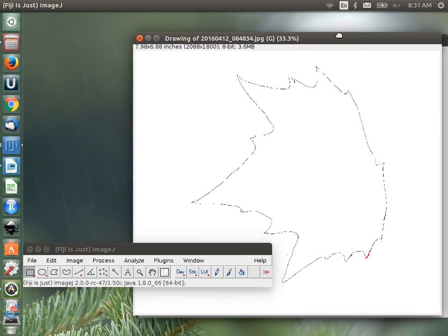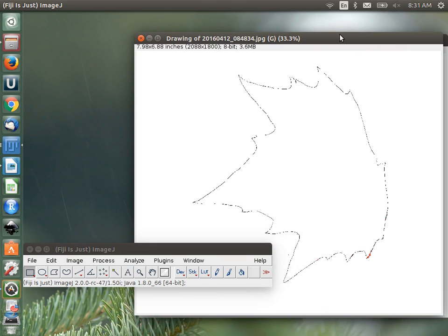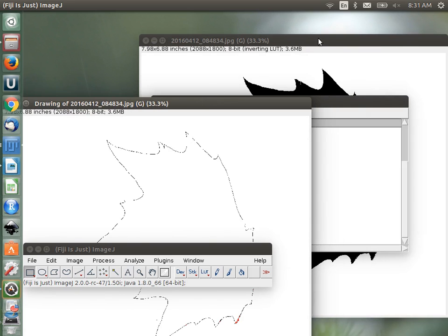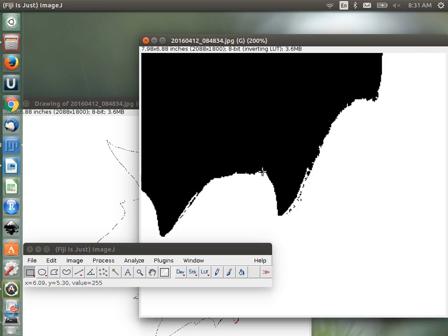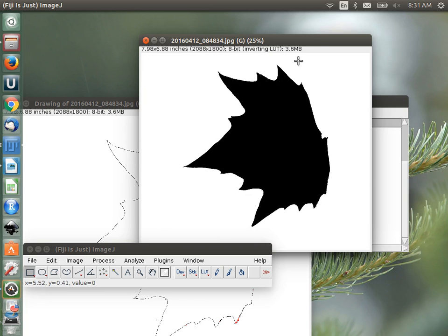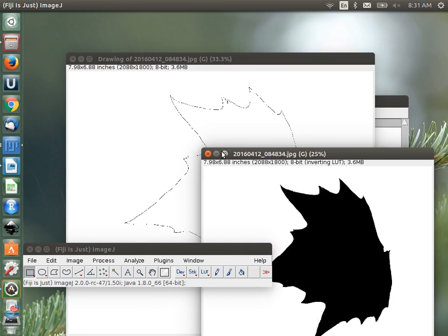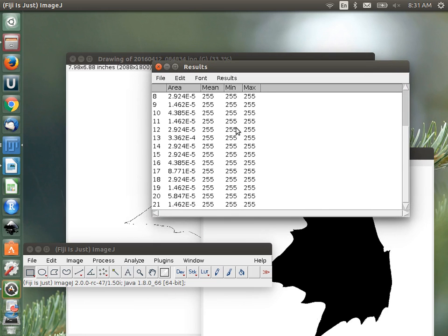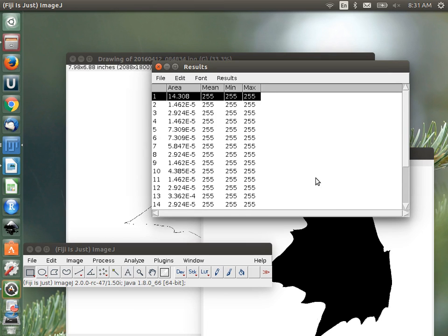There is the outline of the image it found. But notice all these little red things — tiny artifact pixels that were also selected. If we zoom in on the original image, we can see it selected many small artifacts around the edge, coming from a shadow in the original picture. Going to the results, we have all these extra entries — but the only interesting one is the first, which gives area of 14.308 square inches, consistent with our previous measurement.